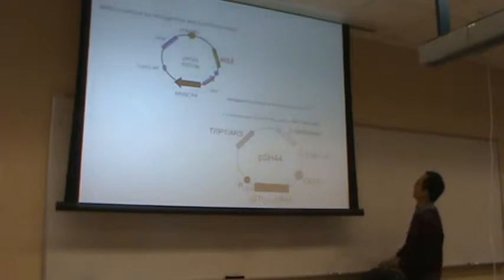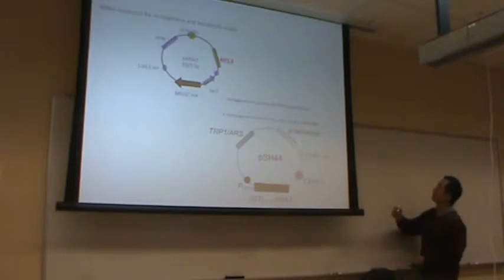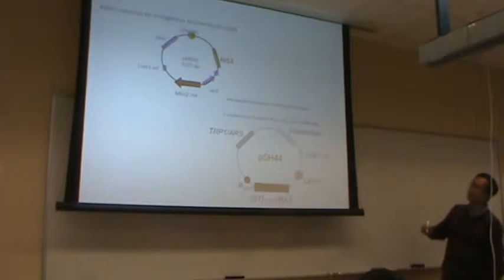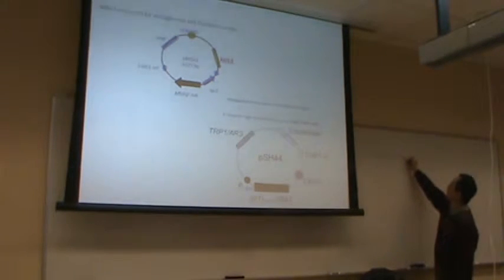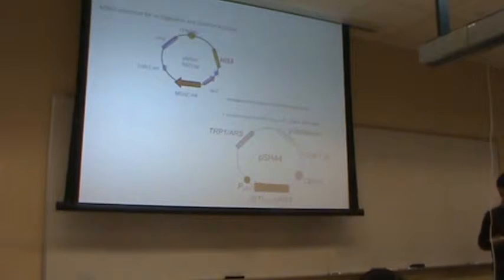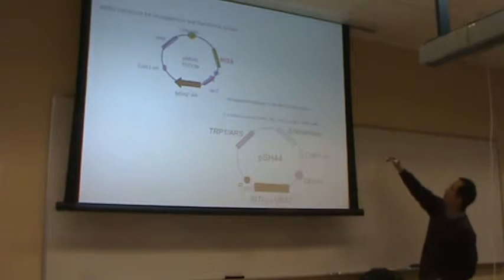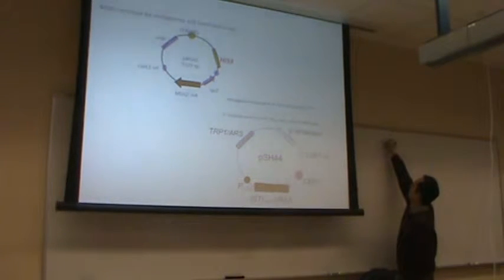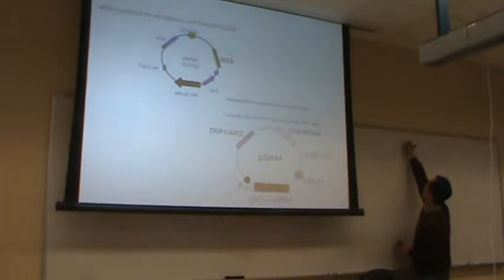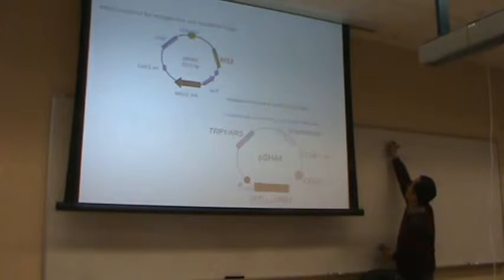How do I spell tryptophan? Sorry. Minus histidine. I had to say it and then write it to get it right.